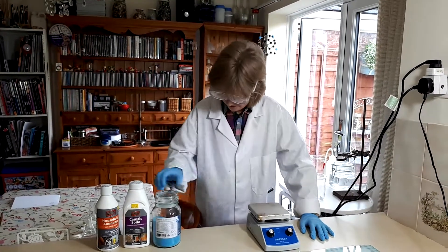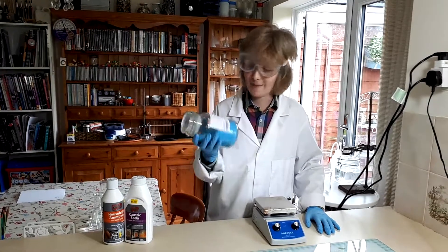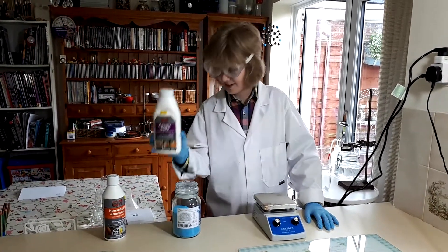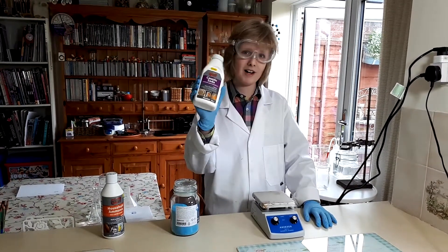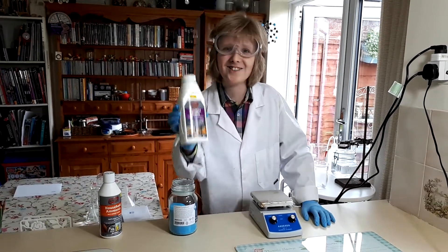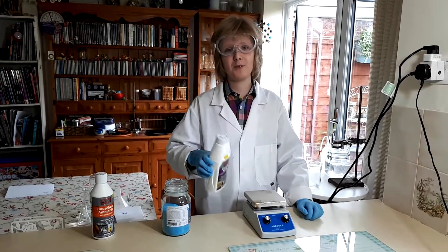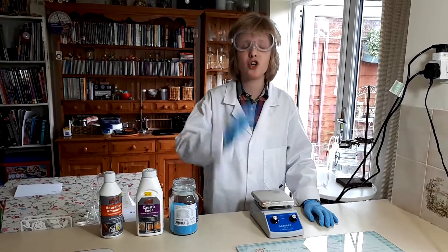So what you'll need is some copper sulphate. You can buy this online from Amazon or eBay. Caustic soda or sodium hydroxide — I'm just using regular drain cleaner stuff, but you can also use special lab grade stuff from Amazon if you wish to make tip-top quality stuff.